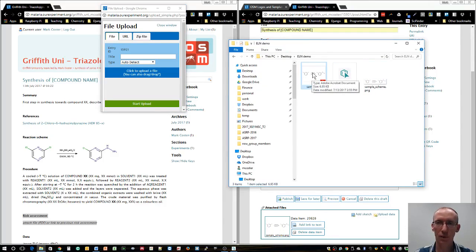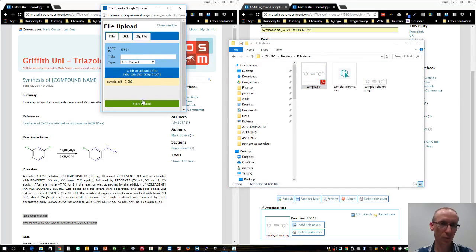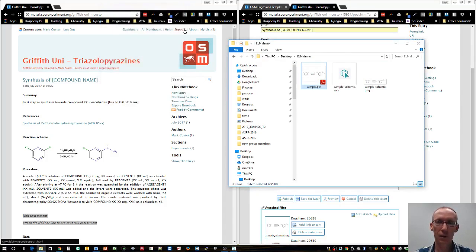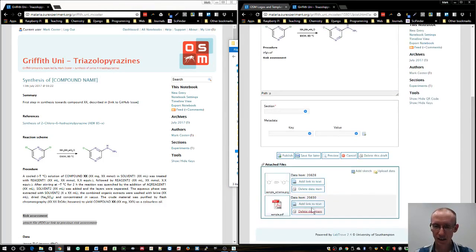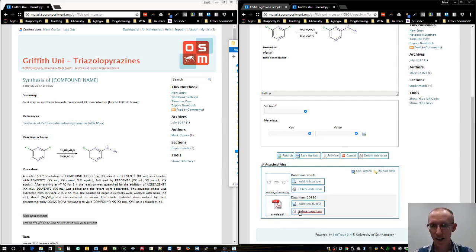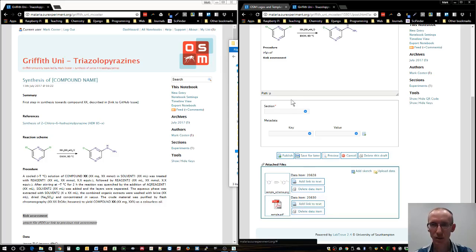I've got just a sample PDF file. It's actually not the risk assessment, it's a copy of the reaction scheme, but just to show you how this works with PDFs. We'll upload that, close that window, and go back to our lab notebook. You can see that second file is here as a PDF.